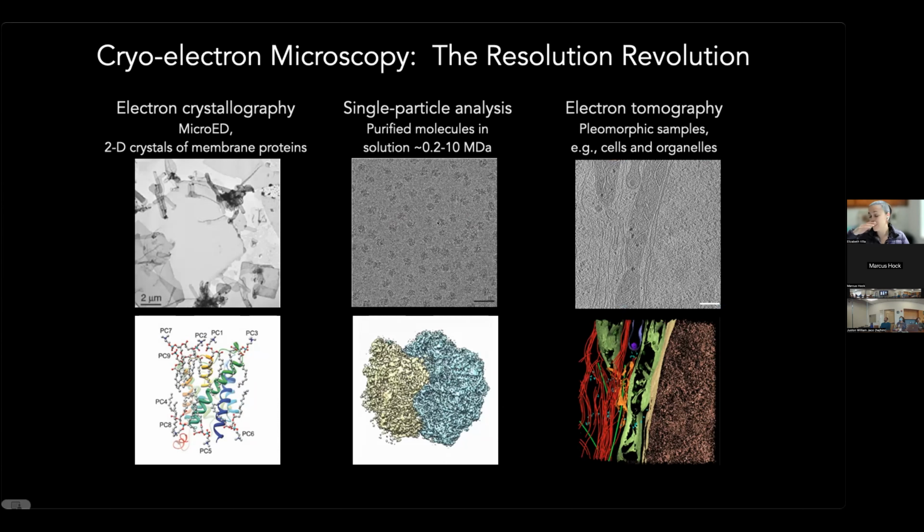And it's a projection through the entire sample, exactly the same as an X-ray. So if you catch enough images in enough different orientations, basically you can reconstruct them in 3D. And that's single particle analysis.